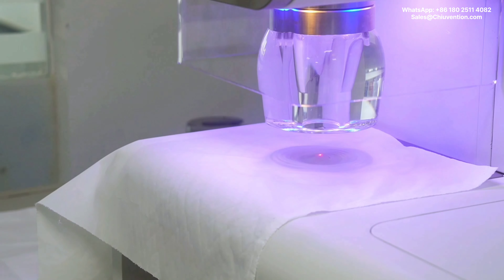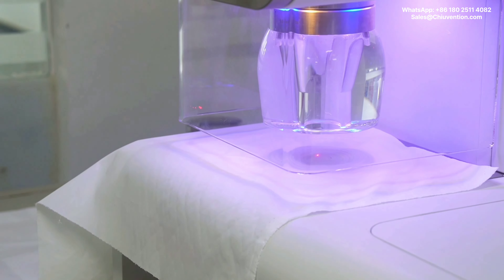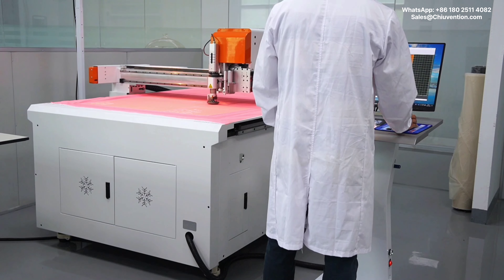How does the hydro-busting method work? The hydro-busting strength tester is used to perform this test. It uses hydraulic busting to determine the busting strength and expansion of knitted fabric, woven fabric, non-woven fabric, and laminated paper.